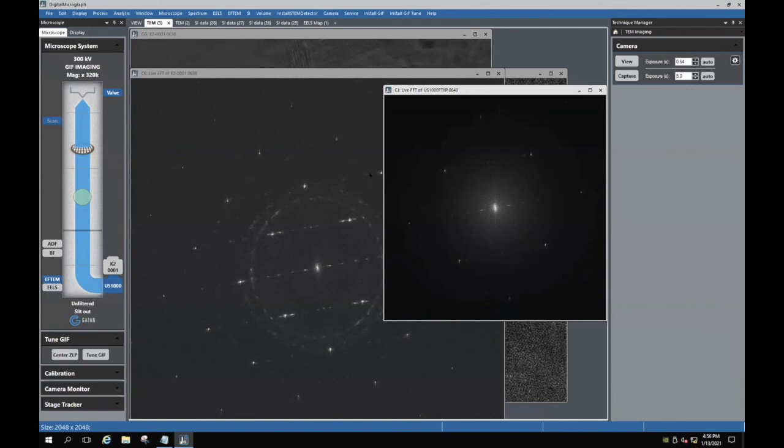Sure. Oddly, we're in the most conservative condition you can be in, because every time you change magnification, the beam blinks. I'm not sure what condition that is, but that was our issue today. That's not a problem. The problem is that if the beam is illuminating a certain area, you want to make sure the beam stays in the same area when you change magnification, and doesn't move or change in size. Agreed.